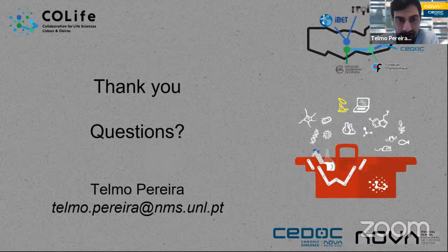Okay, so let me stop. So yeah, of course you need to discuss with us what type of camera you want, or what different architecture you want. Usually the microscopes, when they are bought, already contain the best camera possible for that particular system, for that particular point in time where it was bought. So usually you are already well served in that regard.